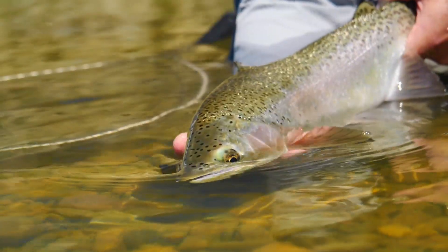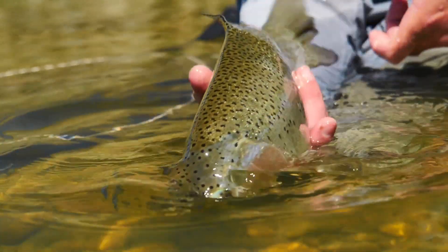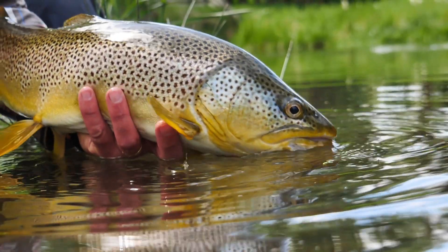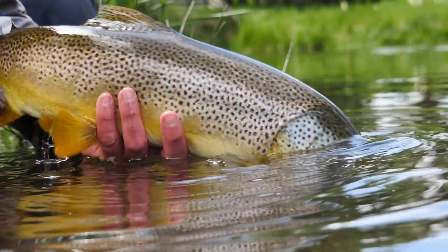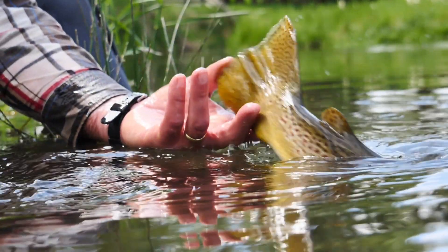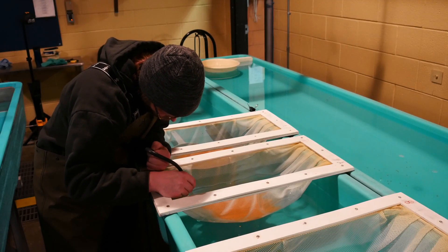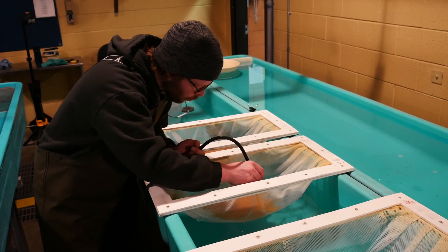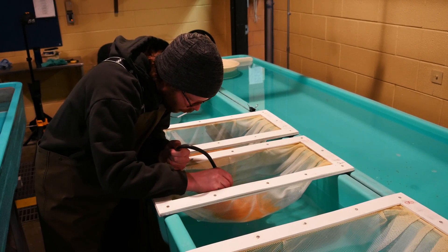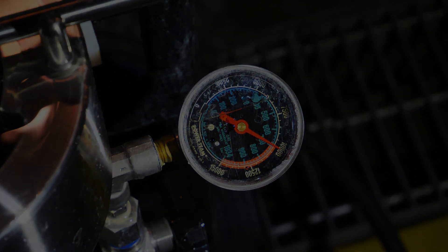Triploid trout can live longer than diploid trout, and growth in size can be substantially more than diploid trout if managers delay harvest in waters where these are stocked. The process also reduces mortality of stocked populations by elimination of post-spawning season stress, as there is no development of eggs and milt. The triploidizing process is labor intensive, requiring specific attention to detail via small batches of fertilized eggs being pressure shocked. This results in the retention of a third set of chromosomes, causing sterilization.